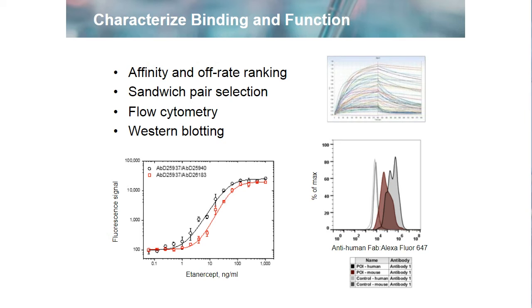And for sandwich pair selection, it can often be quite pronounced how antibodies that all work well by, say, direct ELISA may vary in their suitability as capture antibodies. Some simply don't seem to like being immobilized, whereas those same clones work very well as detection antibodies. Therefore, when we're carrying out a sandwich pair screen for customers, we often look at 100 sandwich pair combinations at a time in order to find the best combinations.